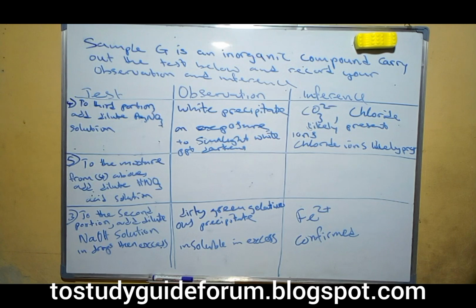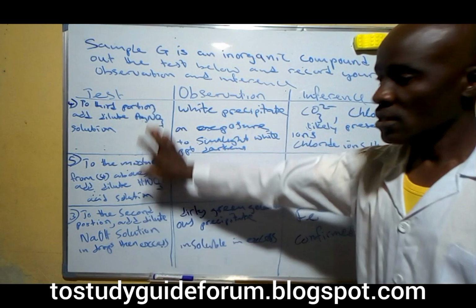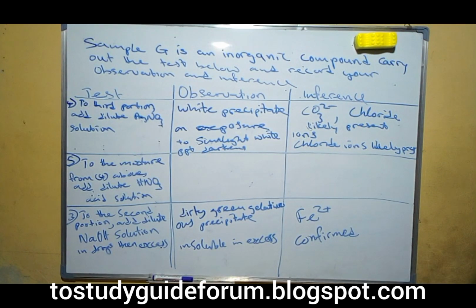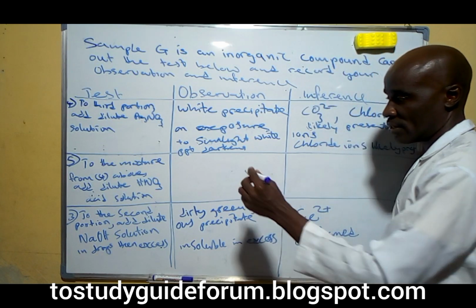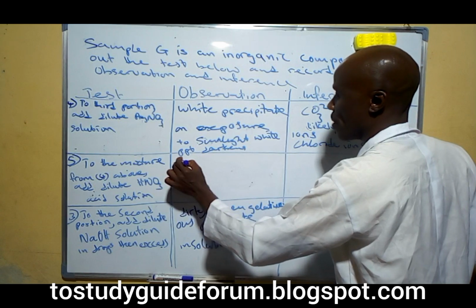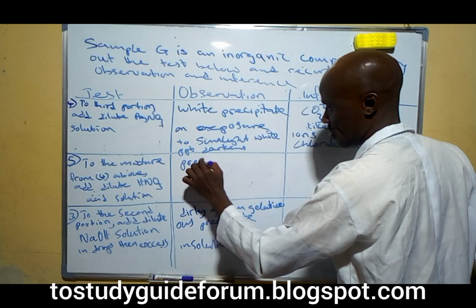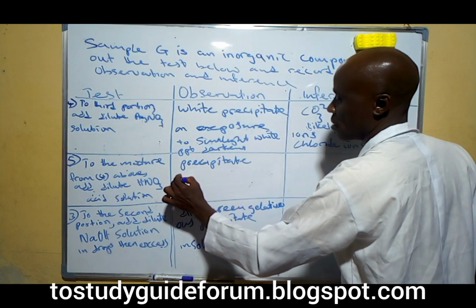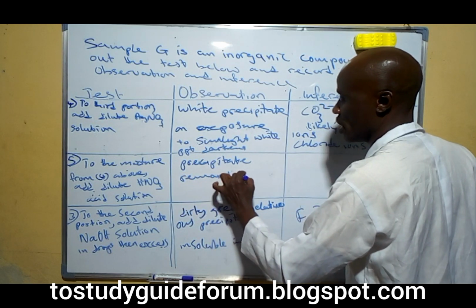To the mixture above, we add dilute nitric acid solution. On adding dilute nitric acid, we notice that the precipitate remains insoluble.